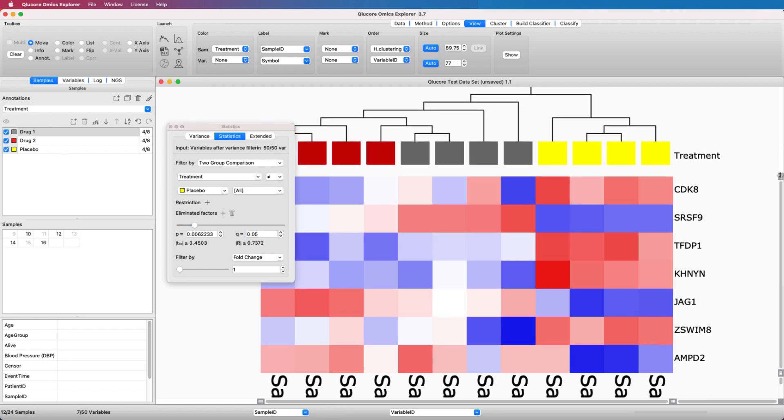The result is directly visible in the heatmap plot, and you can inspect the outcome. In this case, we found seven genes with a QValue below 0.05.